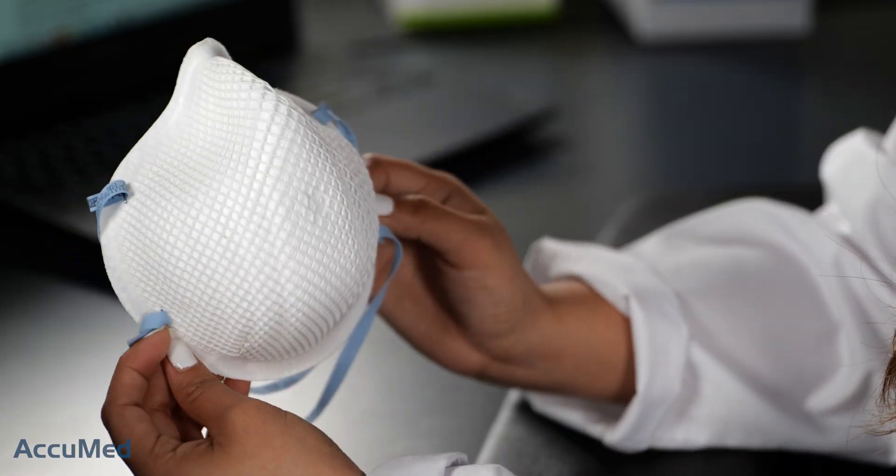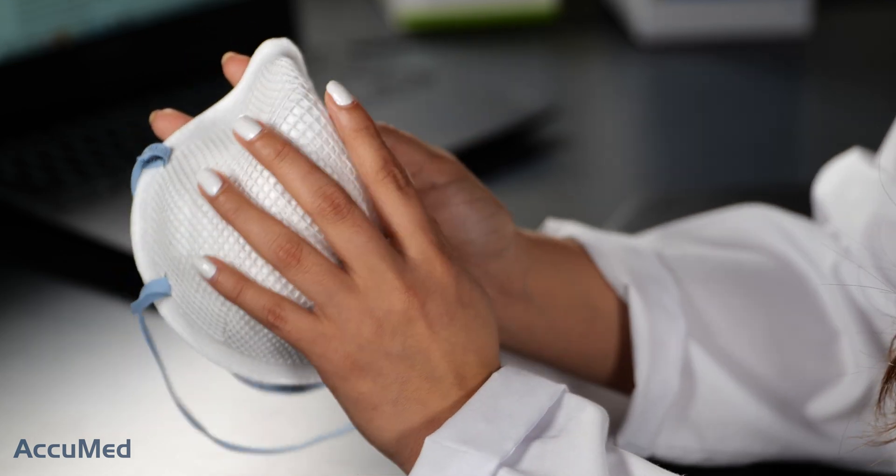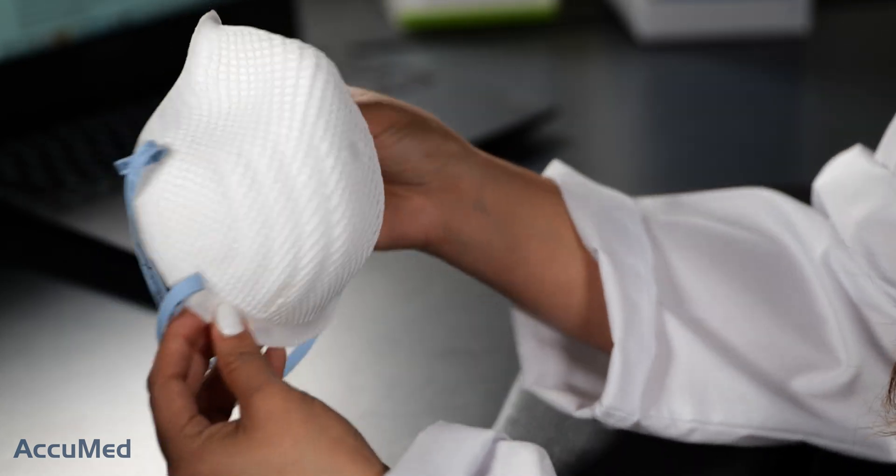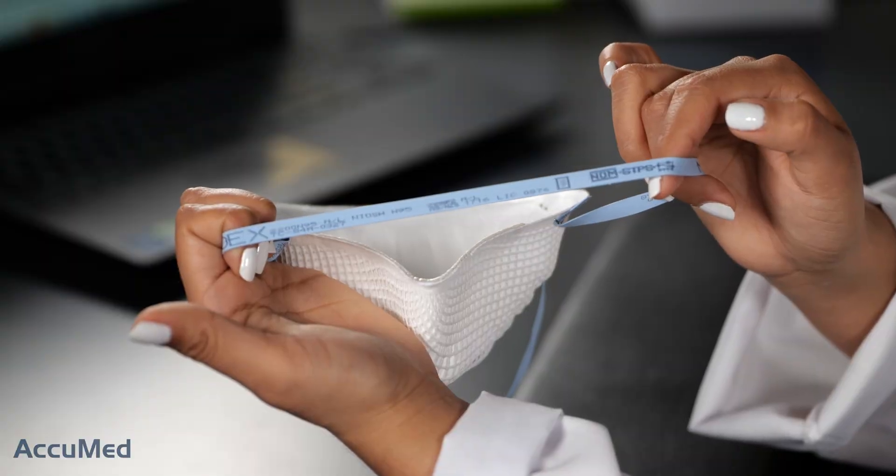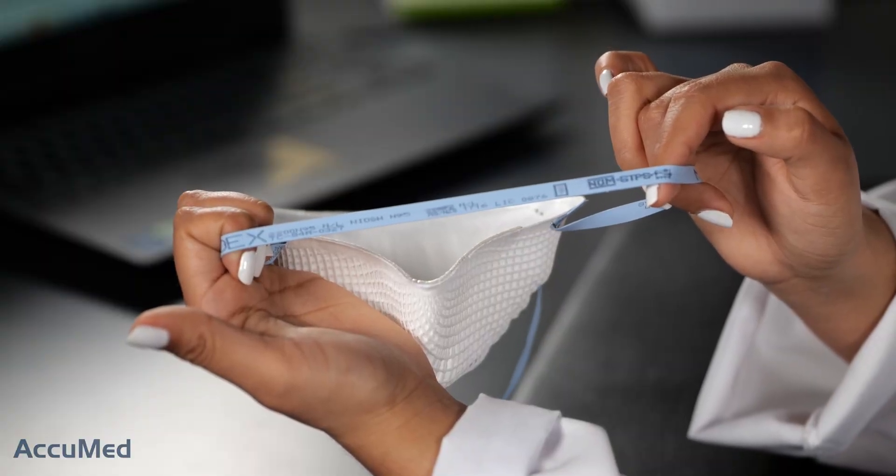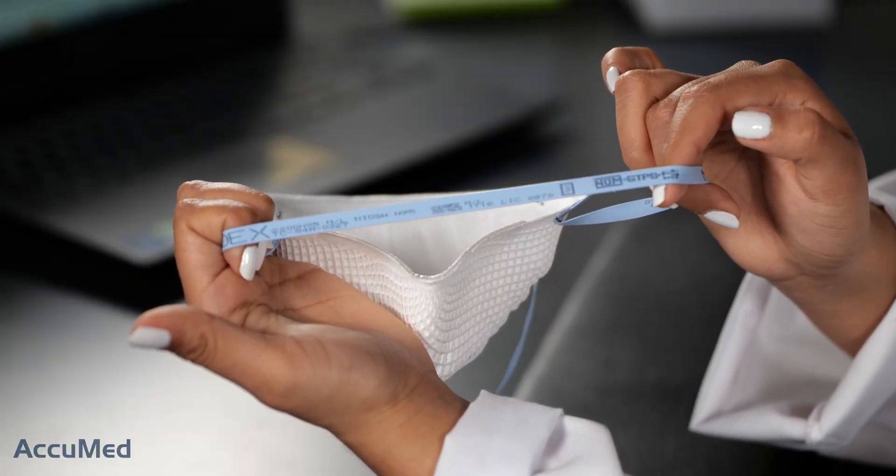One thing that also caught me off is that it doesn't have any of the N95 requirements listed on the actual mask. Okay, so I thought that they didn't have the N95 requirements on the mask, but it actually does have it on the strap. So you guys can see from the headband strap, it has all of the N95 requirements on the headband strap.